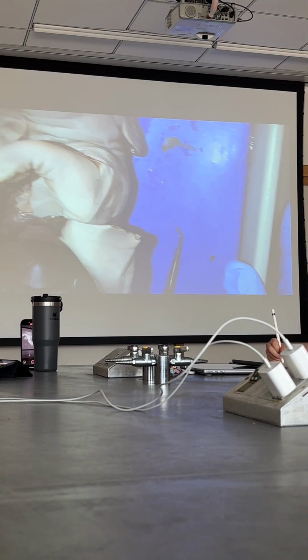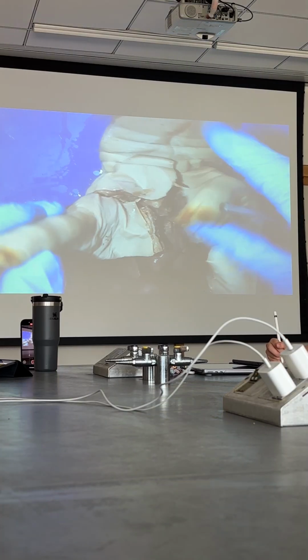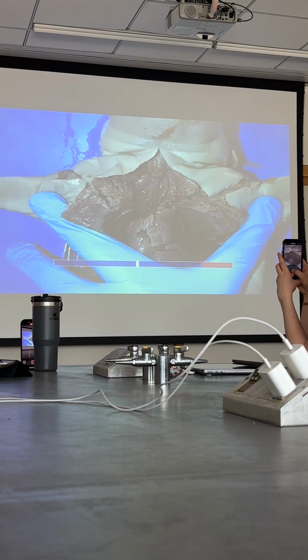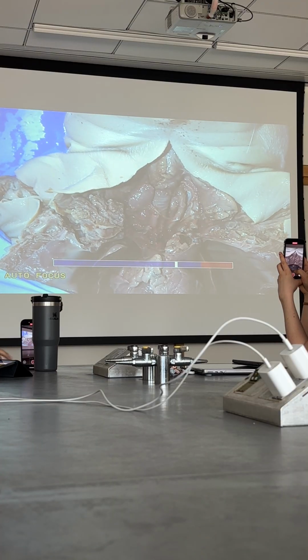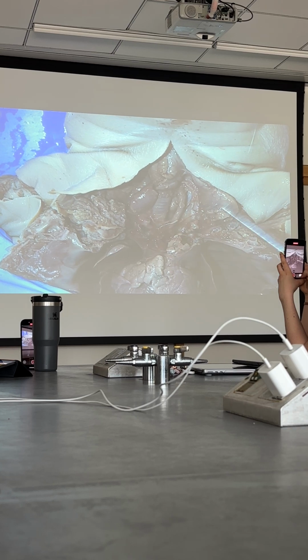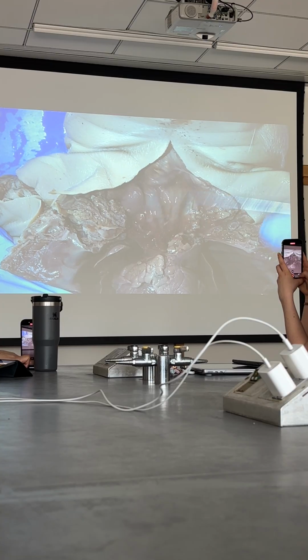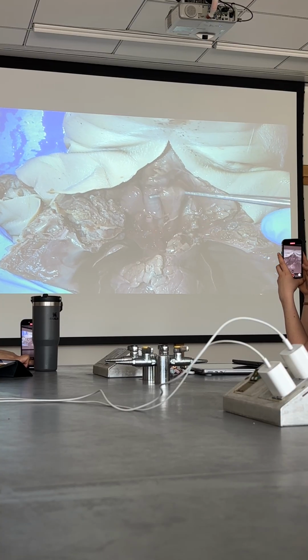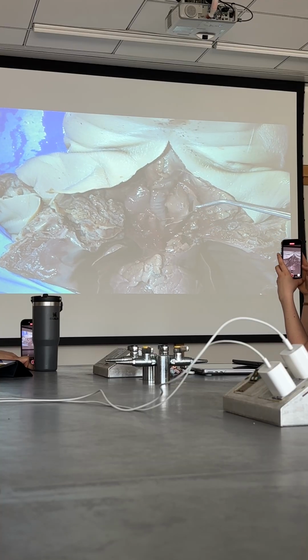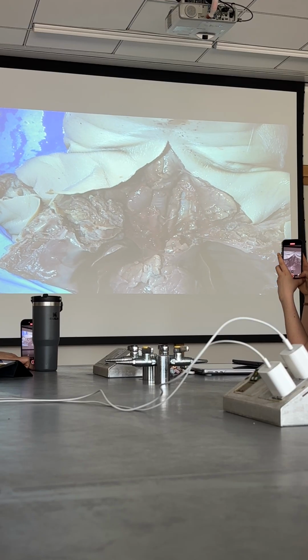So we'll start with the digestive stuff first, and the first thing they have is the esophagus. If you look up here in the neck area, go a little bit closer. Okay. There's the trachea. You can see the stripes of the trachea. But if you loop behind it like this, that's going to be the esophagus. It's basically that muscle. There's no cartilage in it. I know it doesn't look like much, but that's the esophagus on the fetal pig, and it's going to sit posterior to the trachea, right?